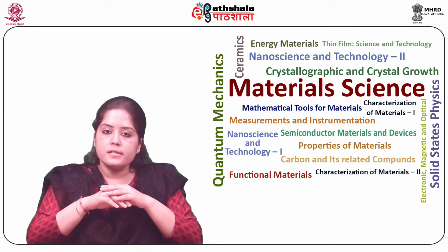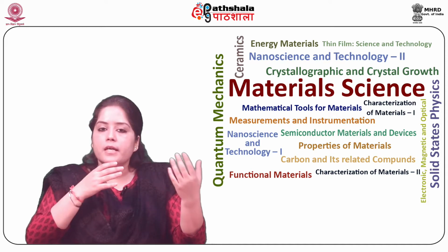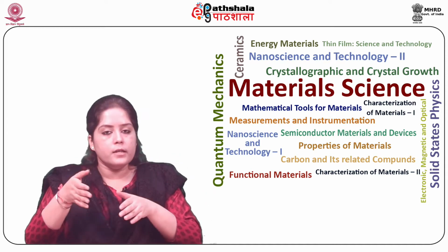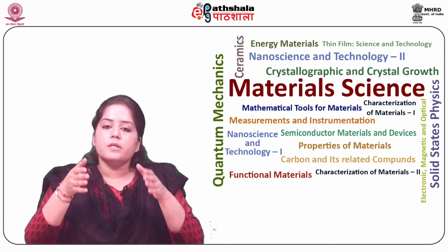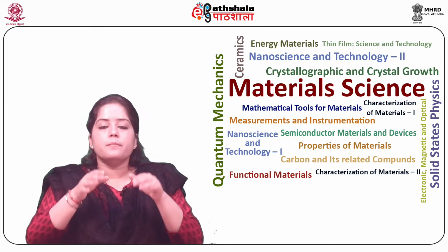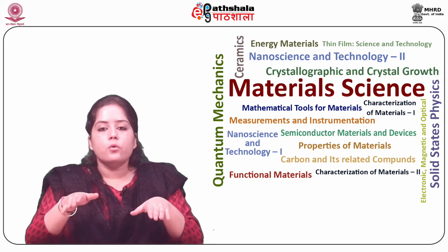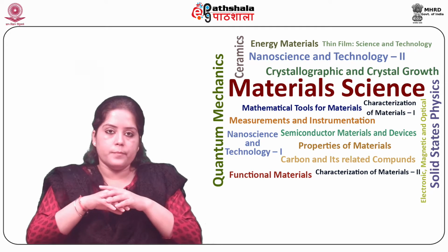Typically, ATR crystals have refractive index values between 2.38 and 4.01 at 2000 centimeter inverse. So it is safe to assume that the majority of solids and liquids have much lower refractive indices.